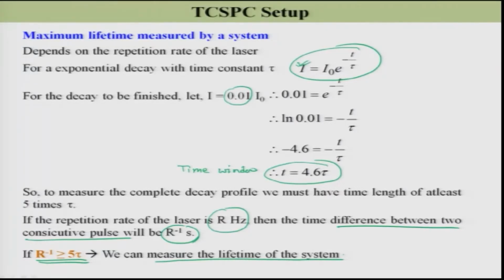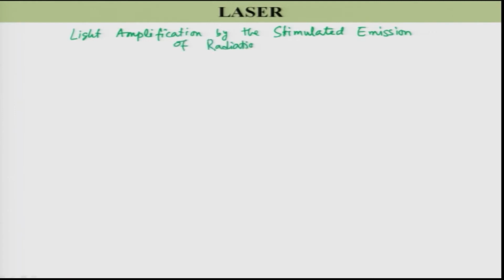Now, let me show you the basic principle of this laser, because when I discuss fluorescence upconversion, this part will be required, right. So, as I said, laser is light amplification by the stimulated emission of radiation, right.